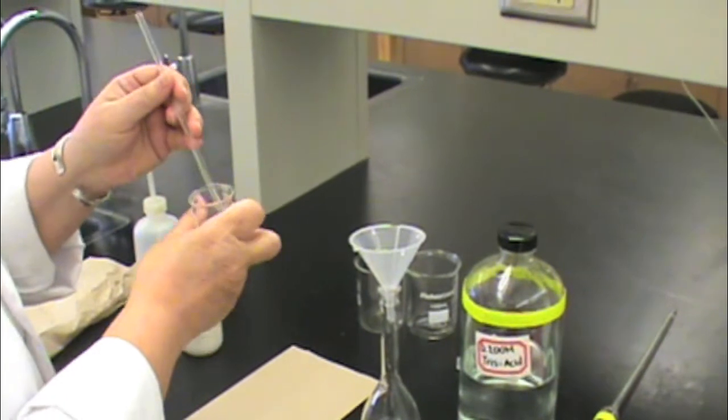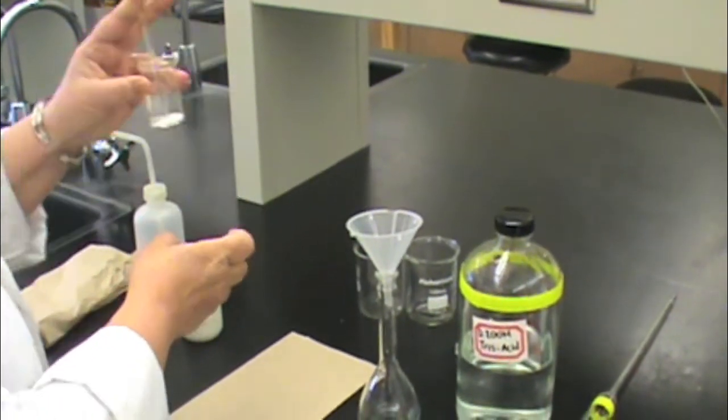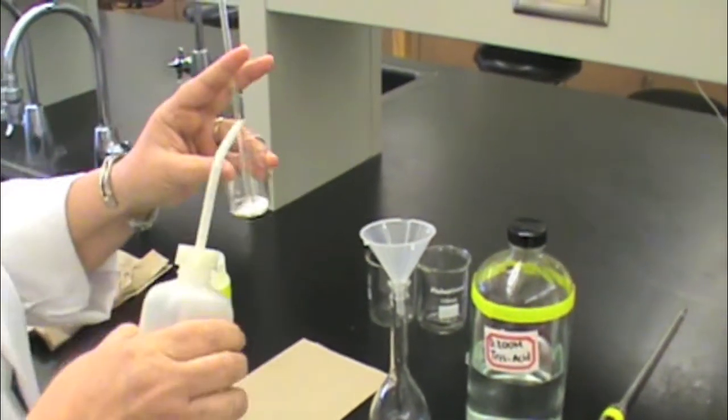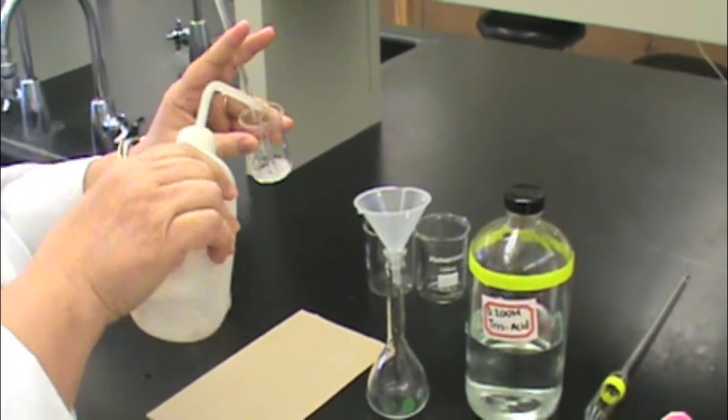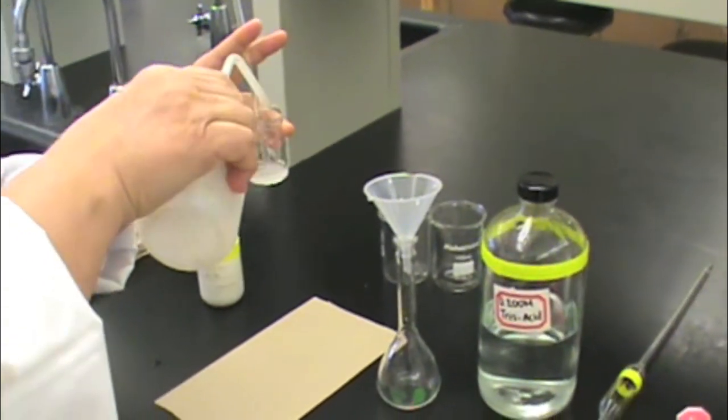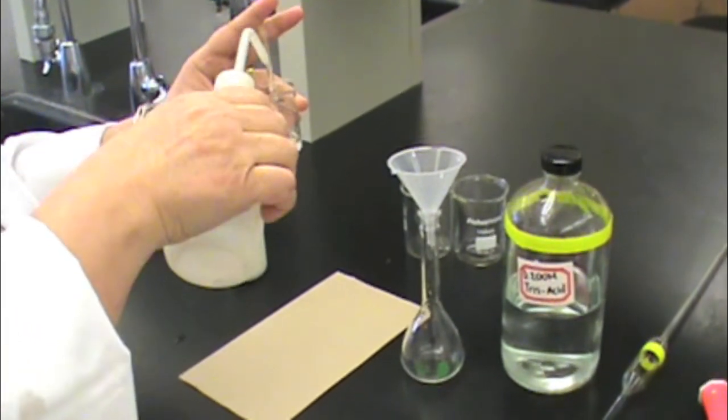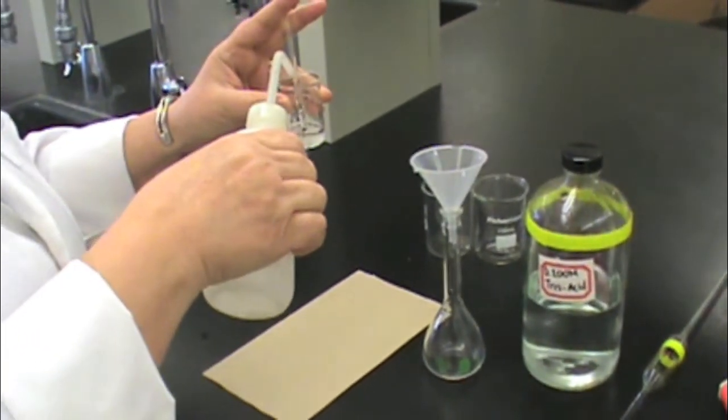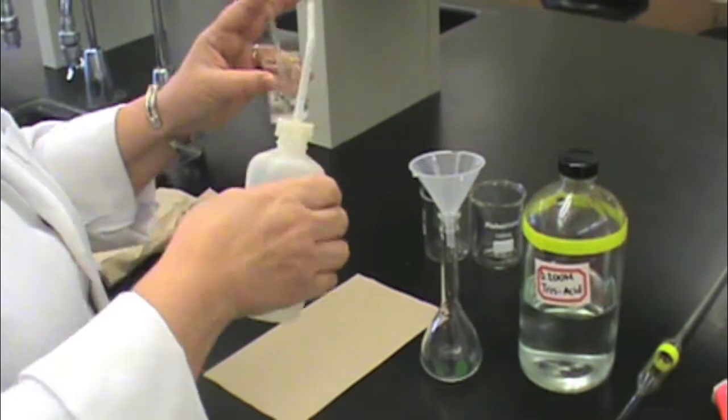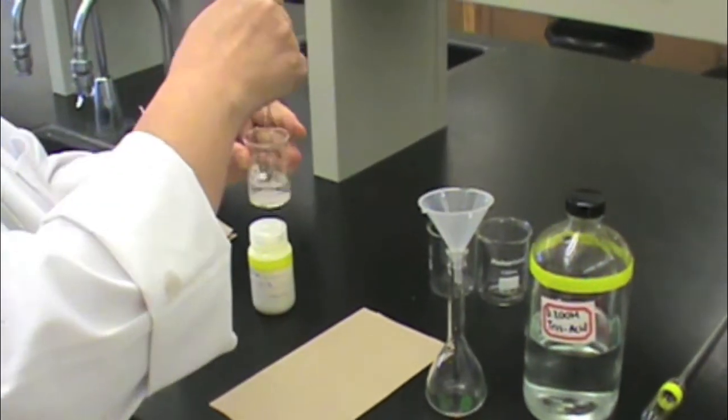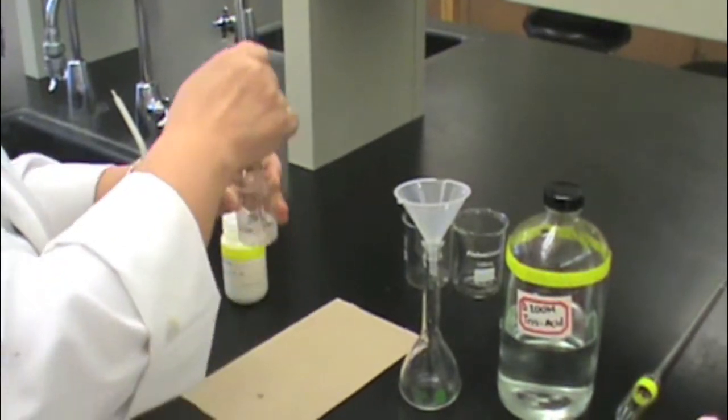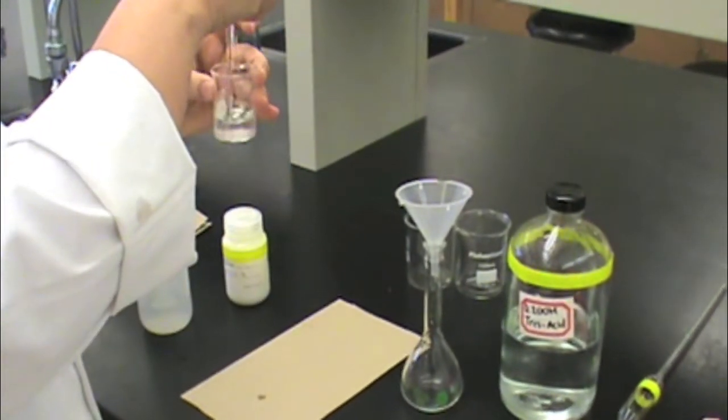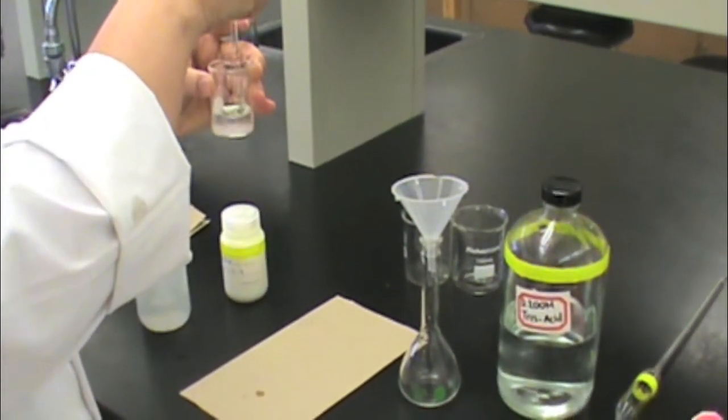Place your stir rod in the beaker containing the solid. Hold it in place and use your wash bottle to rinse some water down the side of the glass stir rod and around the sides of the beaker to help dissolve your solid. Use your glass stir rod to dissolve your solid. Sometimes you may need to add a little bit of extra water to make sure that your solid is completely dissolved.